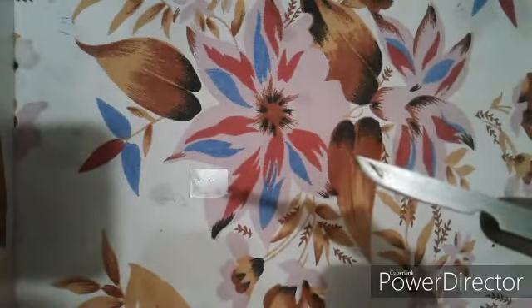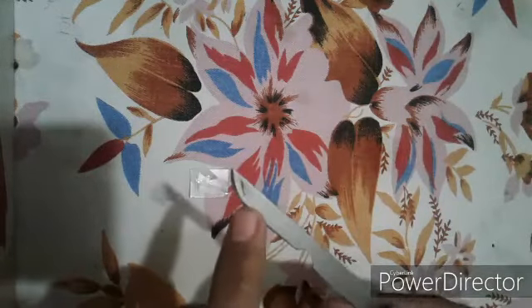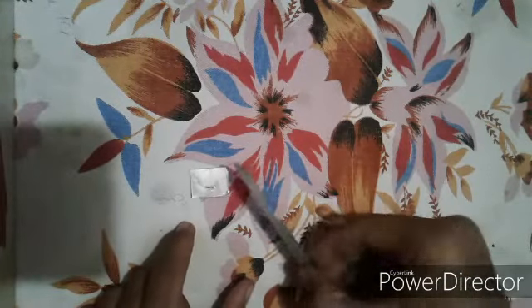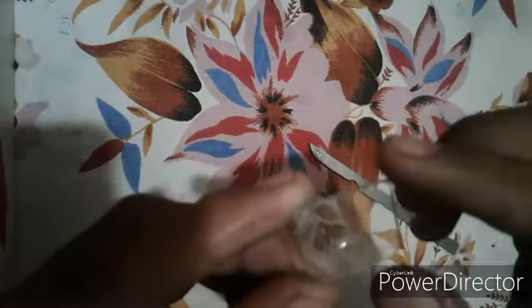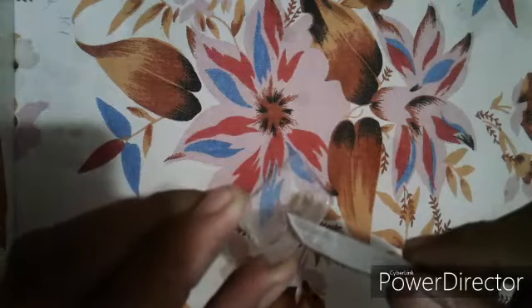This is our peel of stomata. Now we are going to remove the dust particles by putting it in some water. You can easily see that the peel is inside the water, and now we are going to stain it with some iodine solution.